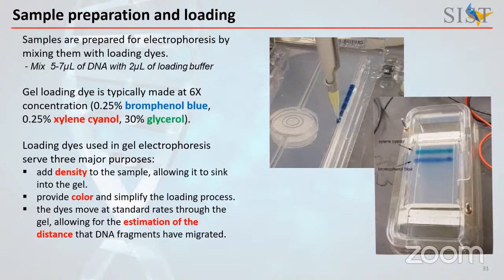So if you have different extracted DNA types, you can load each DNA sample in each well so that you can observe how the extracted DNA is present at the end of the gel electrophoresis.